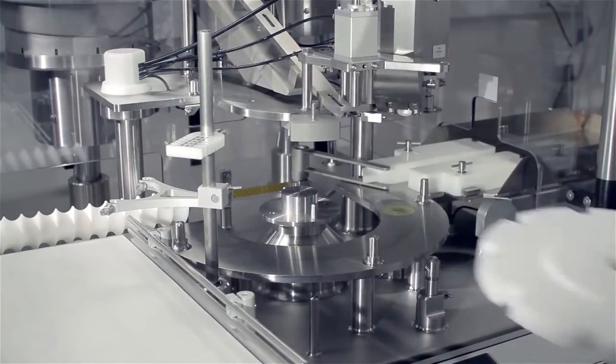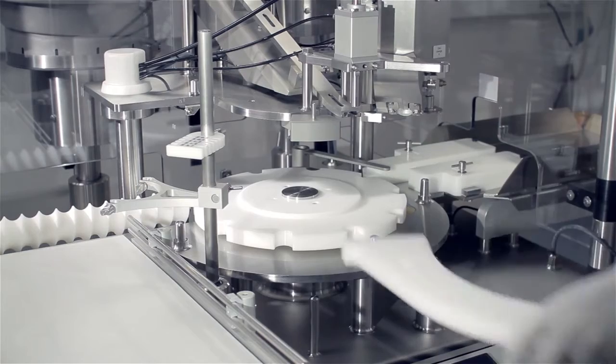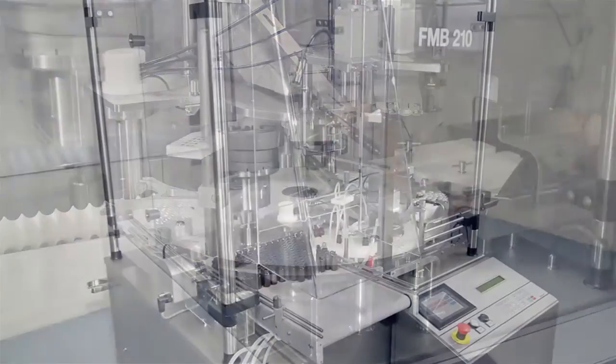A production run can be set up in under 20 minutes and the total capacity per working day is unique for this size of filling and capping solution.